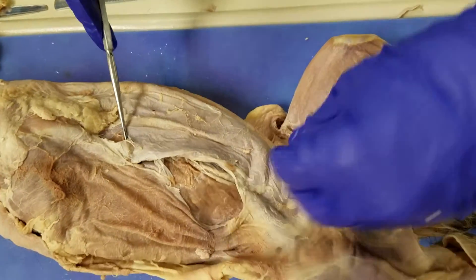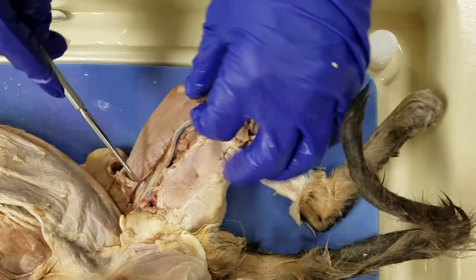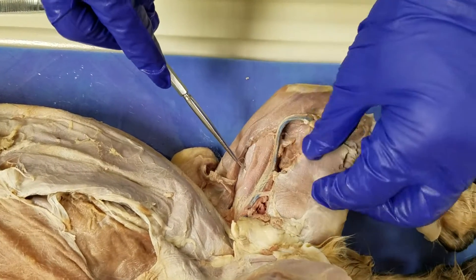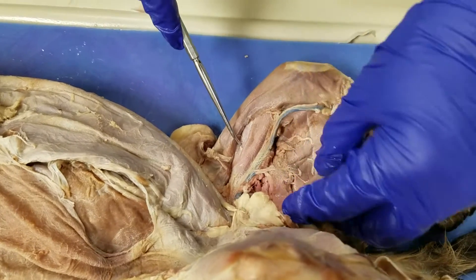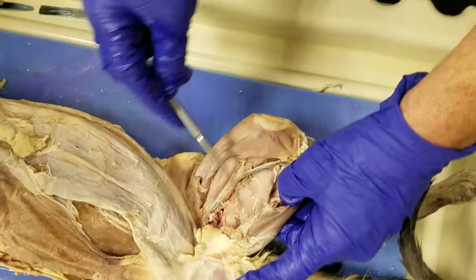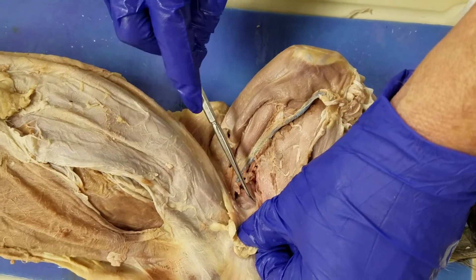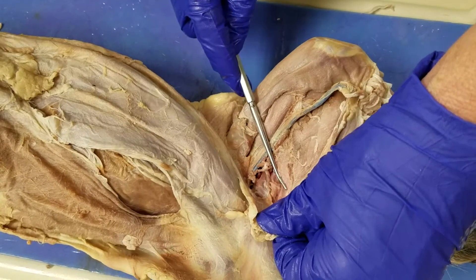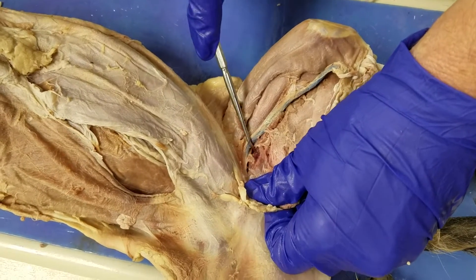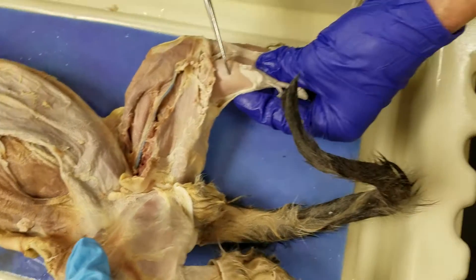She goes all the way down — sartorius, gracilis, vastus medialis, rectus femoris, semitendinosus, semimembranosus, adductor femoris, adductor longus, pectineus, gastrocnemius.